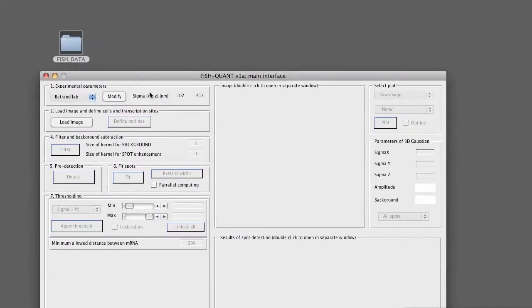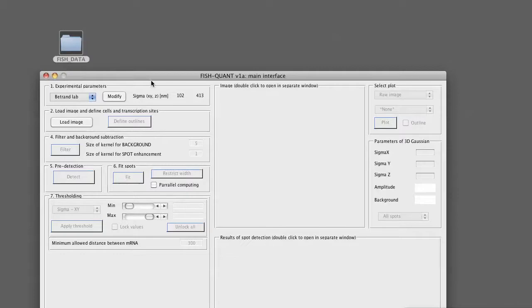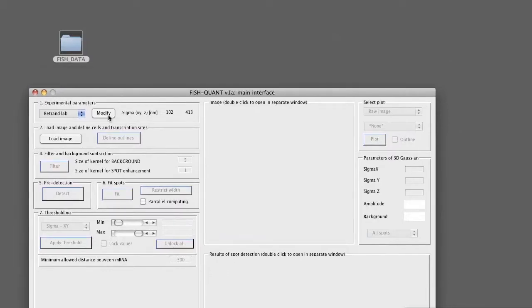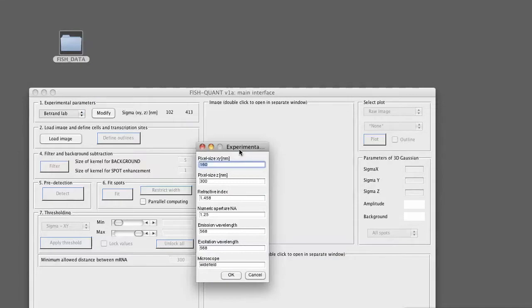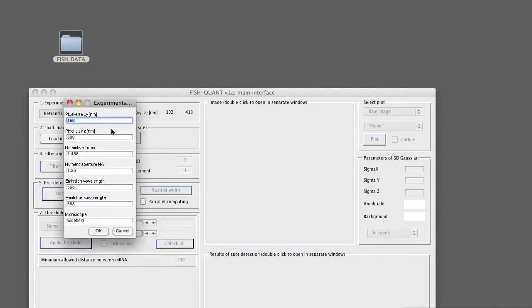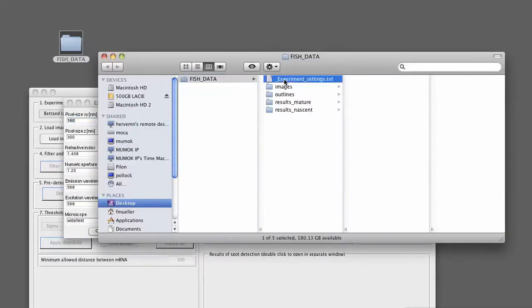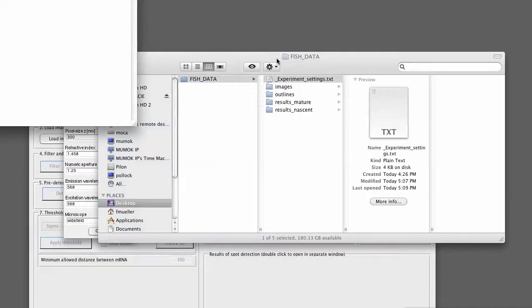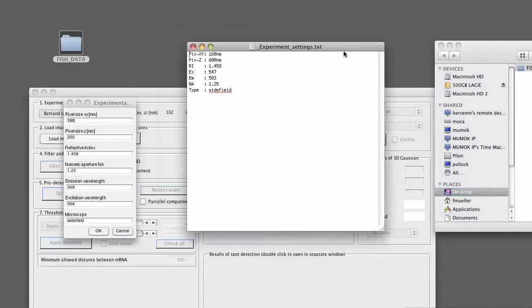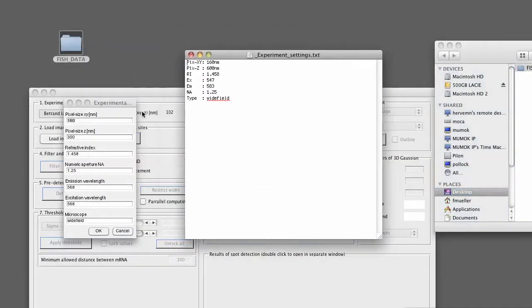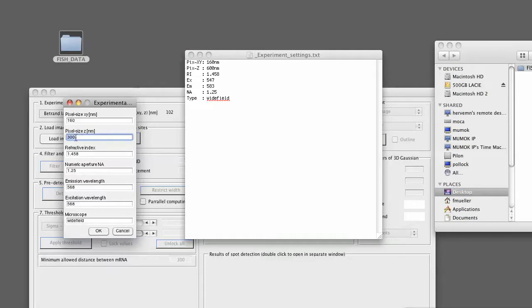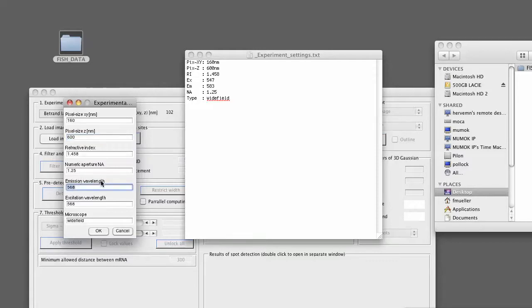As a first step, we have to adjust the experimental parameters that will be used to calculate the theoretical PSF. We do this simply by clicking on the modify button here. There's a number of parameters that we define. I saved those also in a little text file as a reminder. So we basically have to update the step size. The refractive index is the same, numerical aperture is the same, emission wavelength we have to adjust, and also the excitation wavelength. Microscope is wide-field, so that's okay.